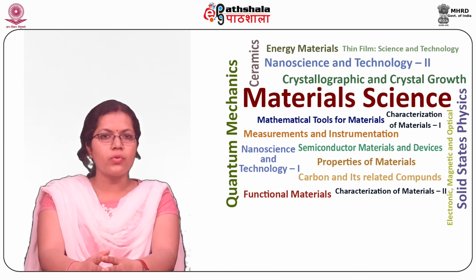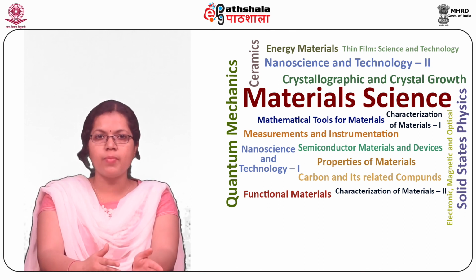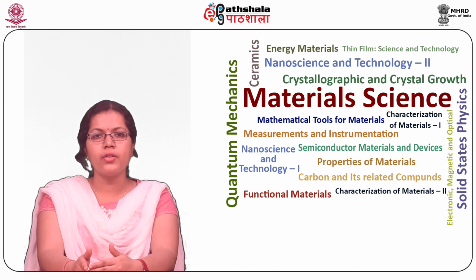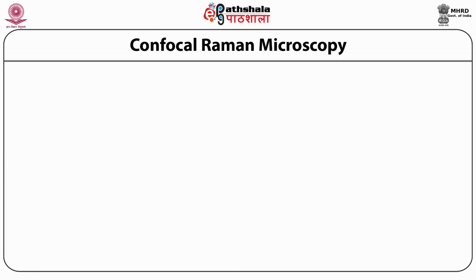This type of Raman microscope has proven to be a useful analytical technique. It shows a set of advantages such as high spatial resolution and clear image quality. In addition, the sample needs no preparation. Now, let us see the instrumentation.